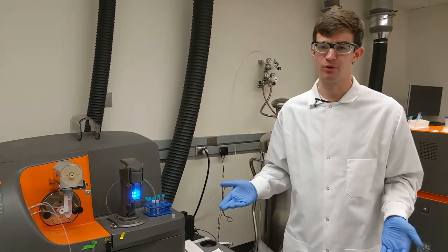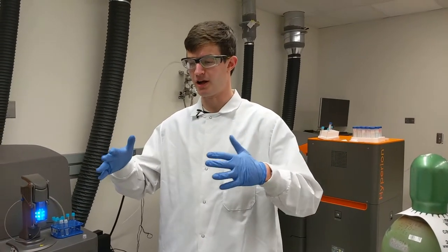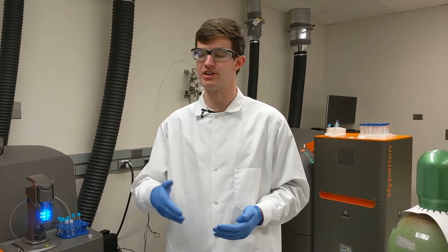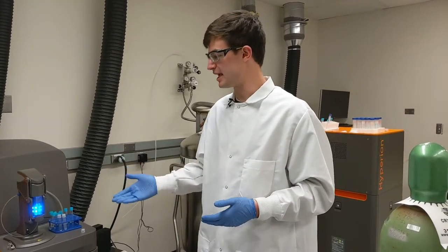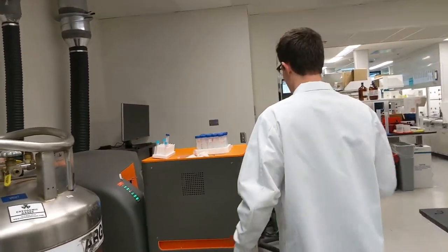And this is especially important when you're looking at the immune system. The immune system just consists of an army of a bunch of different types of cells, and they express dozens and dozens, actually hundreds of different proteins. So really, to be able to understand the immune system, it's important to get this high-dimensional data from machines like the mass cytometer. Over here, we actually have another mass cytometer.